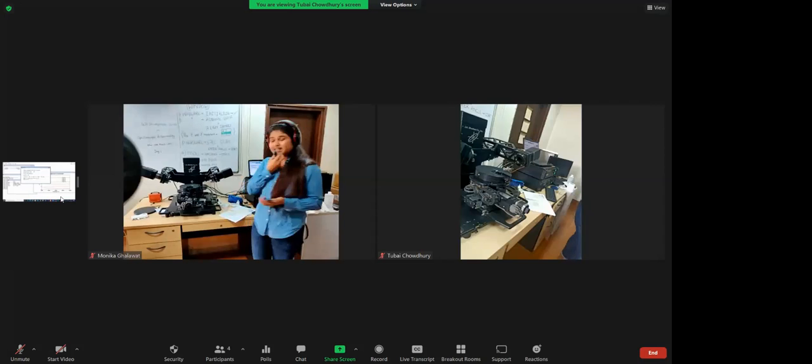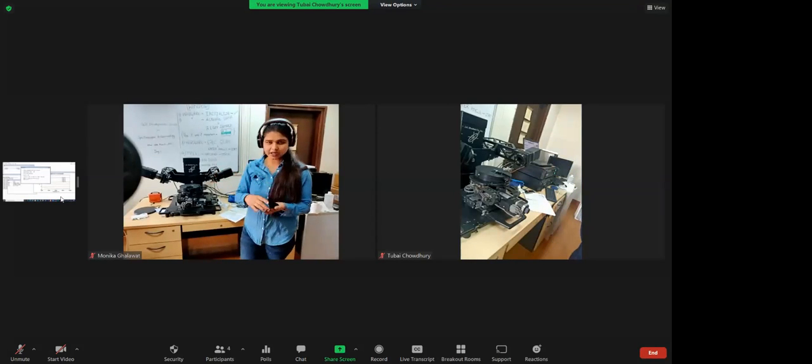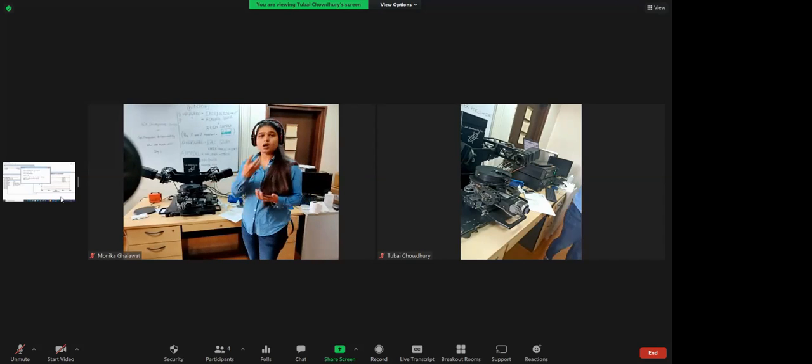And if you have ellipsometry in your lab, you can go for a finer experiment. You can just check with your incoming light. You can just place your film over there. If it reflects the light and you can see it in the detector, it's optically smooth. Otherwise, you will see more light over your sample.